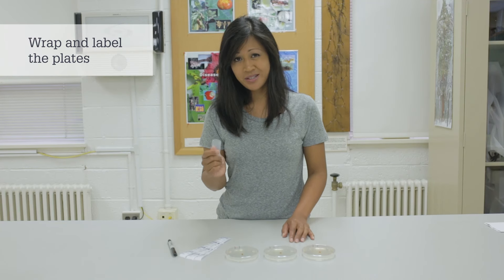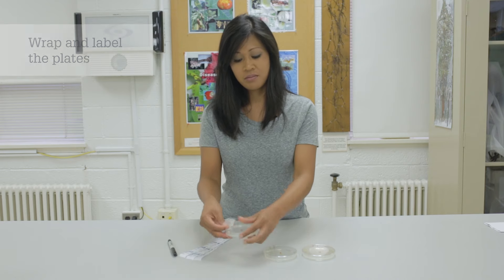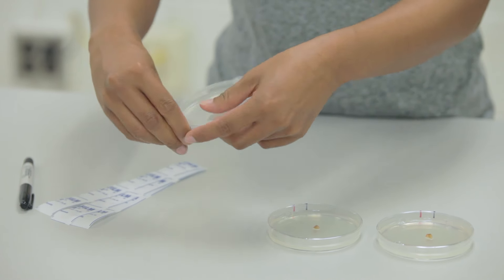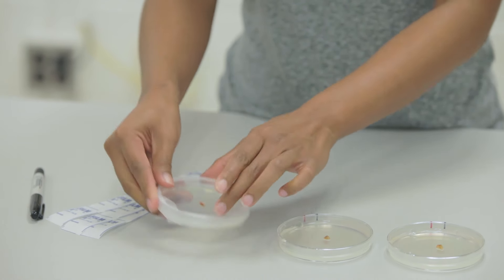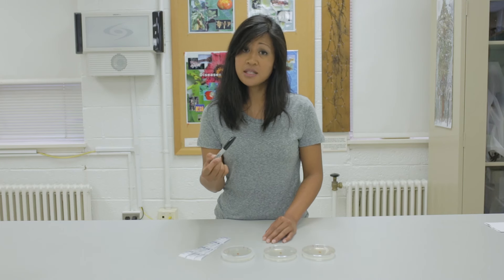Use parafilm to wrap the plates so that the medium does not dry out during incubation. It's a good idea to label your plates with the date and sample ID.